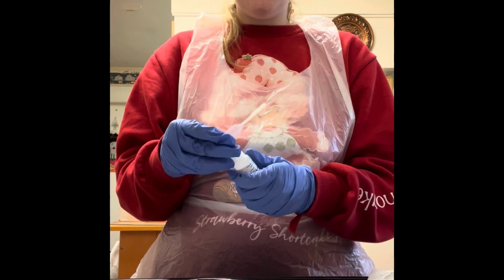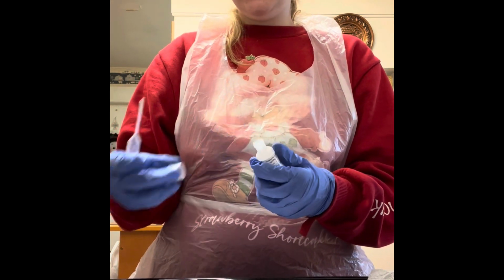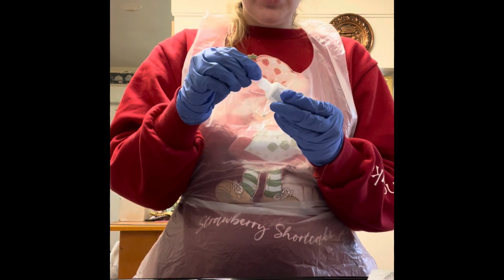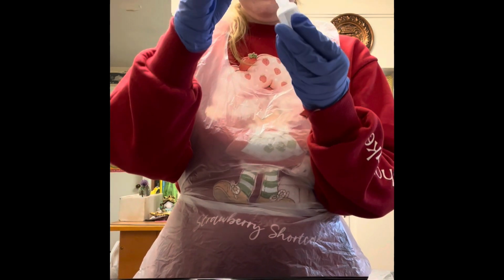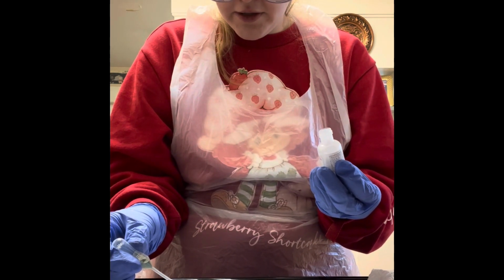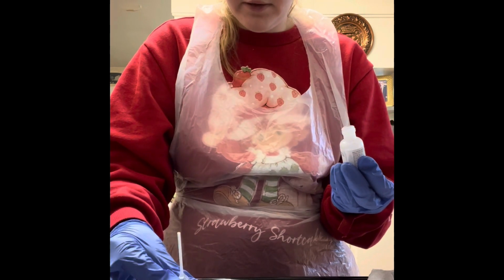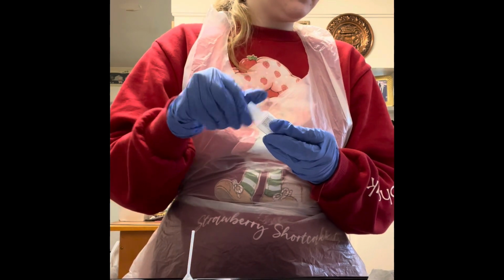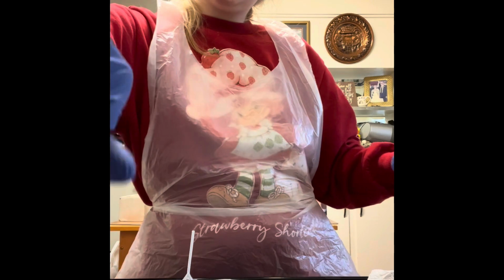I did not clean my well plate out from last time, so there's one drop of the potassium chromate still there. So I'm just going to do it next to it. I know the difference, so it's not going to mess anything up. So I'm just going to do it over here. 1, 2, 3, 4, 5, 6, 7, 8. Oh. And so I'm going to close the top and I'm going to record the color.